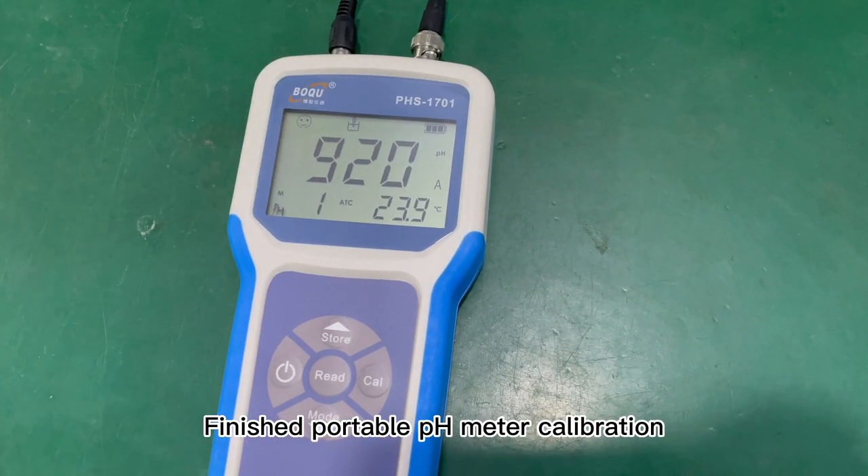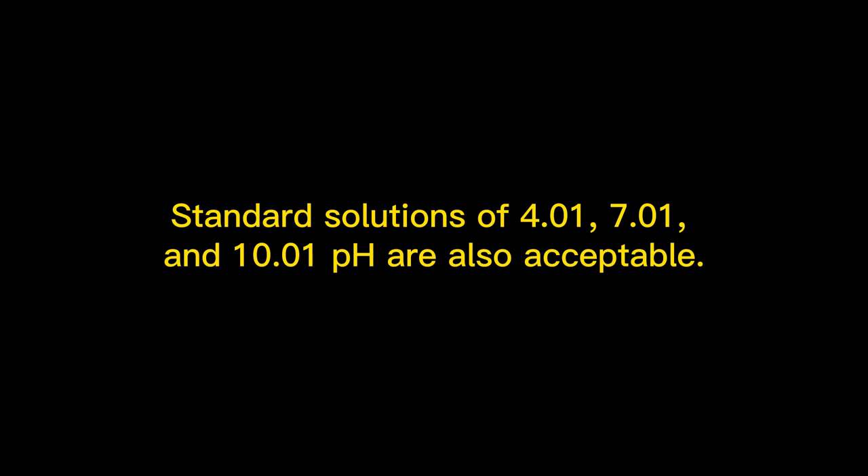Finished portable pH meter calibration. Note that if you can't buy the corresponding standard solution, standard solutions of 4.01, 7.01, and 10.01 pH are also acceptable.